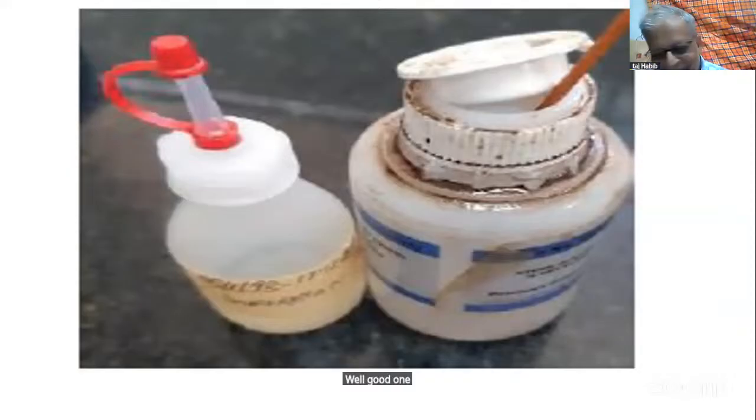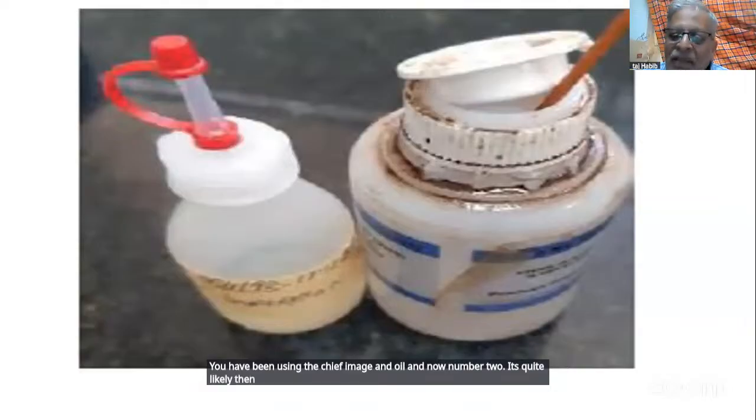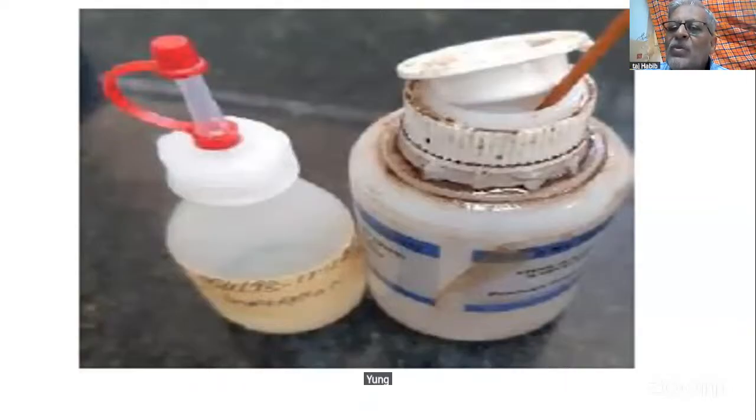Good one. You have been using the cheap immersion oil, and now, number two, it's quite likely that the fungus has gone inside your microscope lenses. Now, I don't know which one.